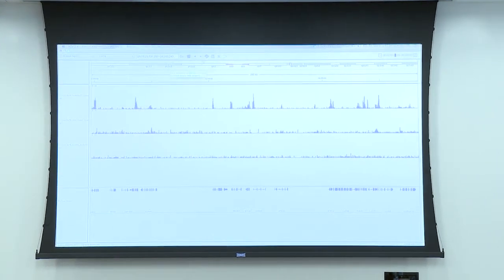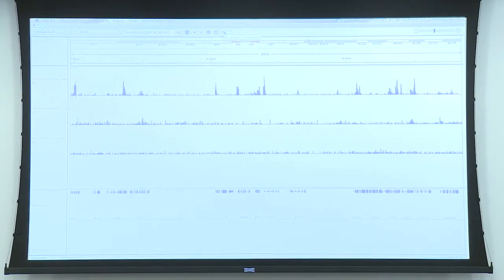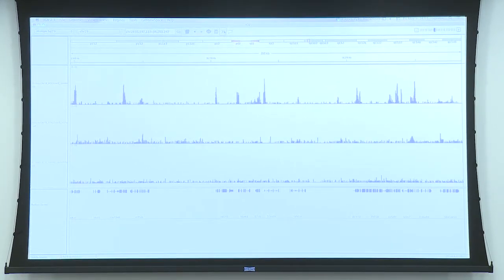And then you have this one here, which tells you resize tracks to fit into window. So that's nice because it fits it into the window. Now, if I use Shift and click on all of them, and then I right-click, I can do set data range. Now, because we want to compare tracks between different samples, I want to make sure that all of them are on the same data range. Sometimes it makes sense, sometimes it doesn't.